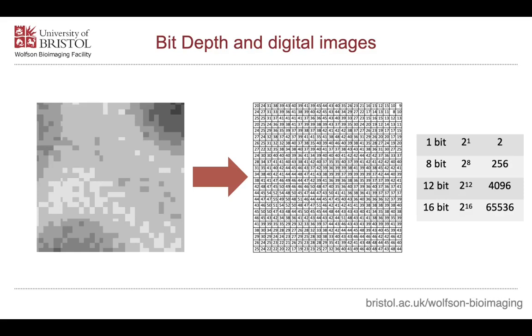So every pixel has a particular color associated with it, and underlying those colors are a whole host of numbers. You can see these areas down here where we have lighter, brighter signal corresponding to about 40, 45, 50 on this scale. And right up here we've got some very dark pixels. These are about 8 or 9, 10 maybe, intensity levels or intensity grey levels.